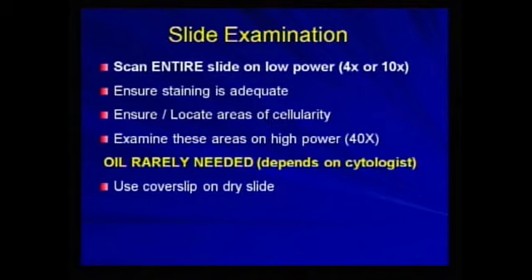After that, you can go to your areas of adequate cellularity and look at those at higher magnifications, generally 40x. One of the things that especially practitioners, but also people who are not familiar with cytology, like to do is put oil all over the slide. And a good cytologist rarely, if ever, uses oil. Oil immersion brings everything very close and gives everything an added feel of malignancy. I would love to take all the 100x objectives off of my resident scopes. As a matter of fact, I would like to take 40x objectives off of a lot of them because you don't need to go down to the highest magnification.